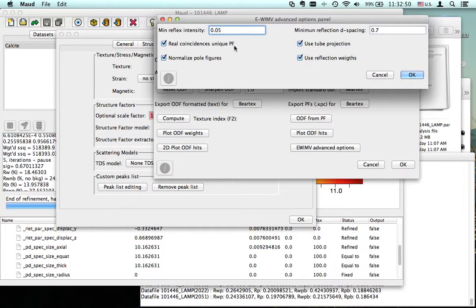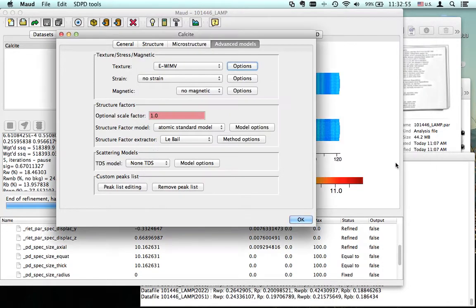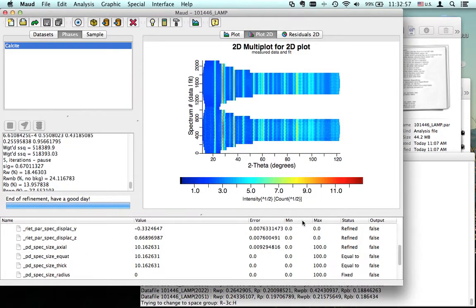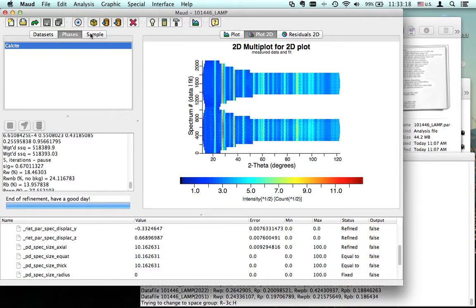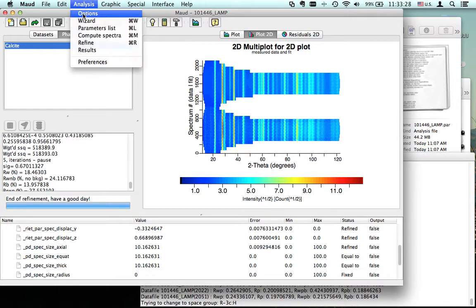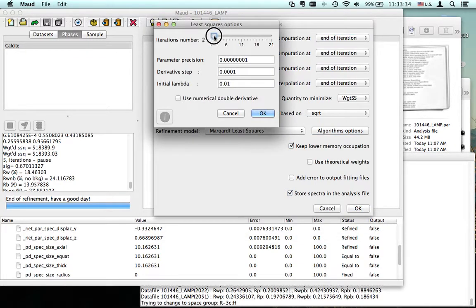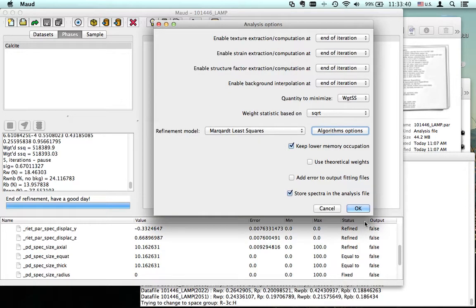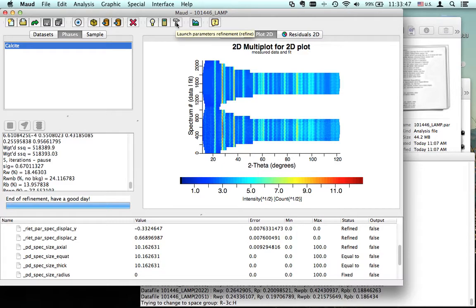Actually, normally in EWIMV, I would not use that because there is high overlapping. My advice is, normally if you don't have problems, use all the reflections that you have in the pattern. Now let's change the number of iterations—we'll just do one iteration. So we will extract the texture with EWIMV and back, and optimize a little bit the intensity.